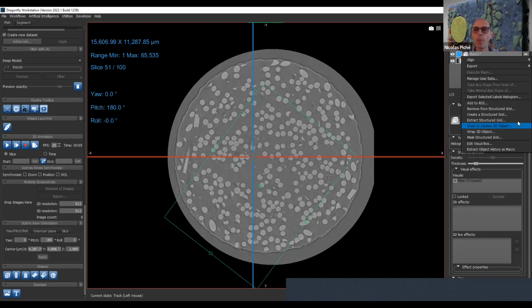Okay, and the box itself has multiple functions that I cannot show. There's too much stuff, but you can make it wrap on object and de-align on object, or take the minimum or stuff like that. That enables you, let's say that you have multiple objects on screen and you want to have the enclosing box of all that. It's easy to make the box that encloses, and after that derive a new series out of it, let's say, or derive a new ROI from the existing ROI, and it will be resampled on the new axis also.